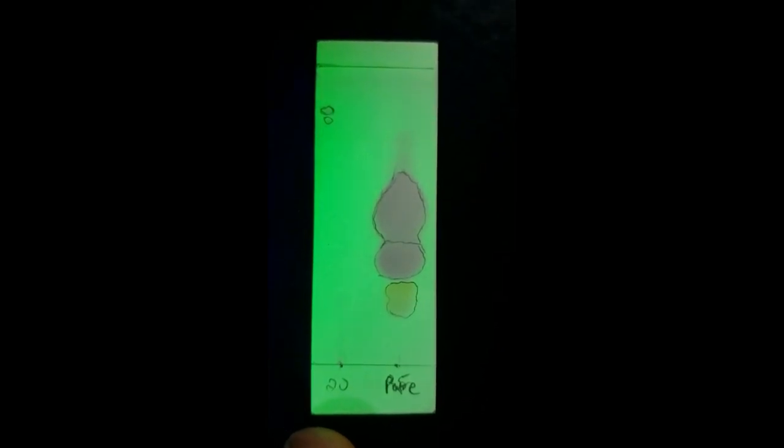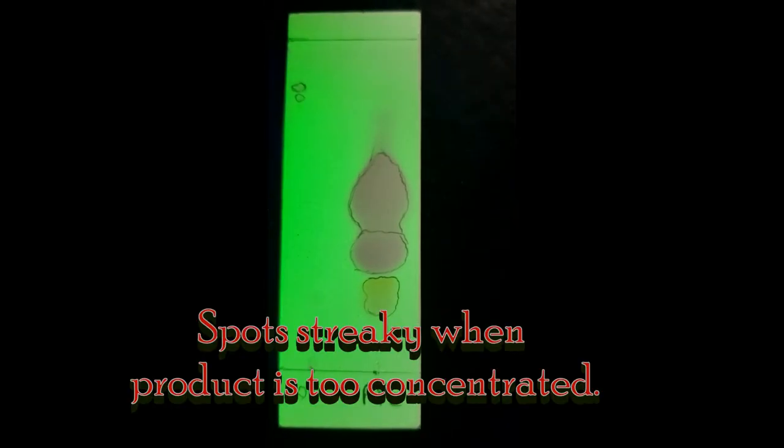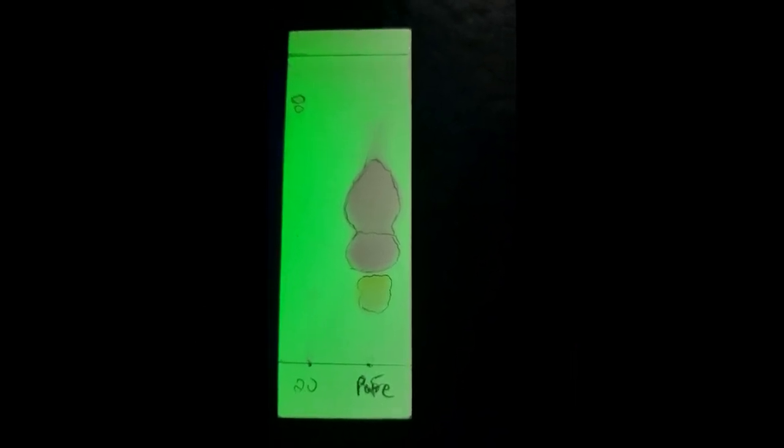Alright, to the left we have the TLC results for fraction number 20. It's obvious that the product had changed, so there's some tiny spots. And then for the pure oil that we got after evaporating, after we finished the column chromatography, this is the TLC result on the right.